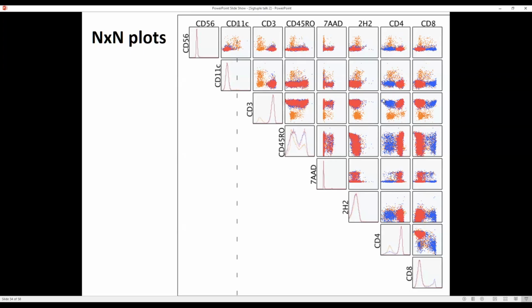I can see there is some compensation error here that needs a bit of post-acquisition compensation. And what else? I can see some problem here, maybe slightly, and here there is some undercompensation. I need to compensate this a bit. Even here, you can slowly adjust this. The data is very well compensated, but you can still see some amount of undercompensation here and there, which can come in any sample.